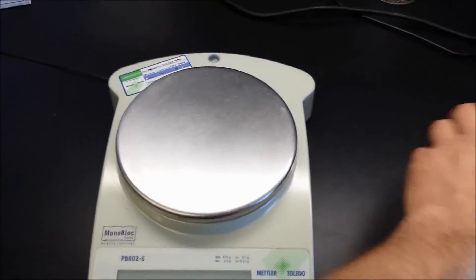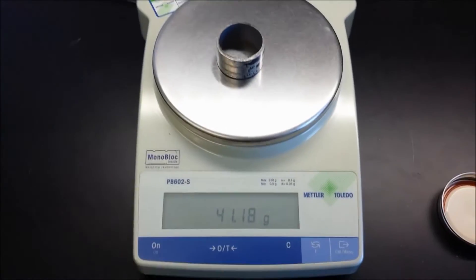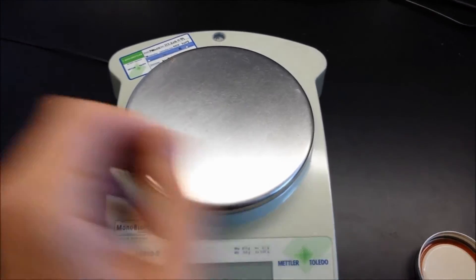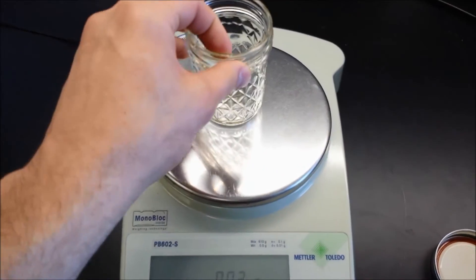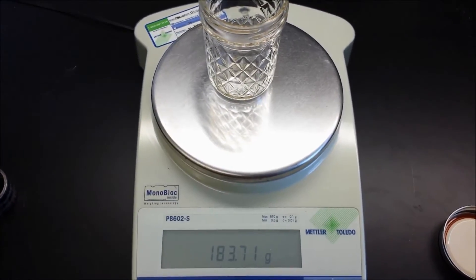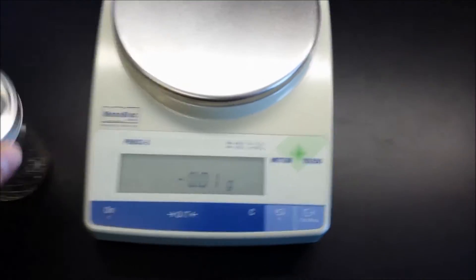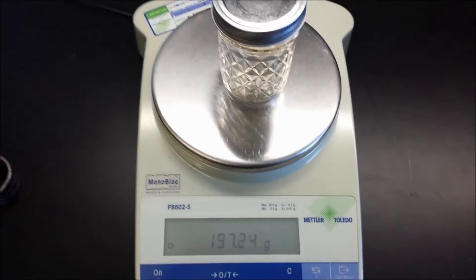Next, weigh the volumetric soil samplers and the soil drying containers, including the lid weight. You will also need to find the volume of the soil sampler and the calibration container. Be sure to record these weights and volumes in your notebook for later use.